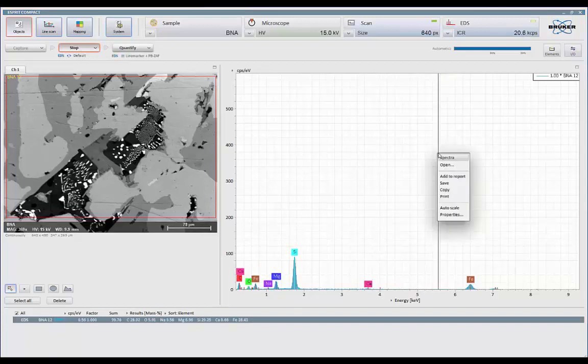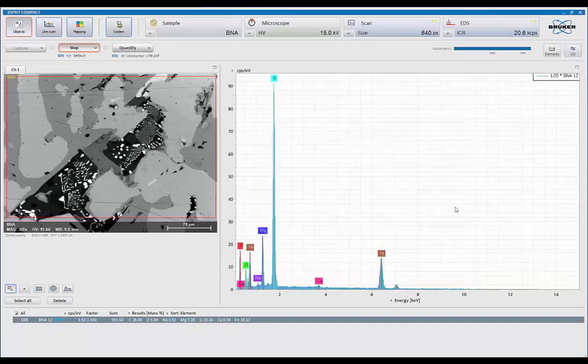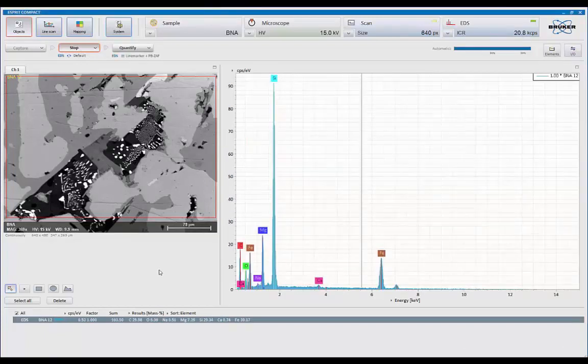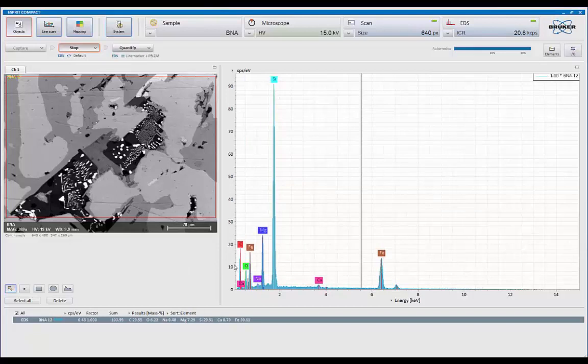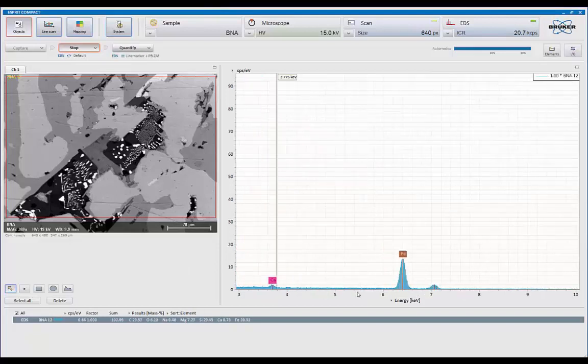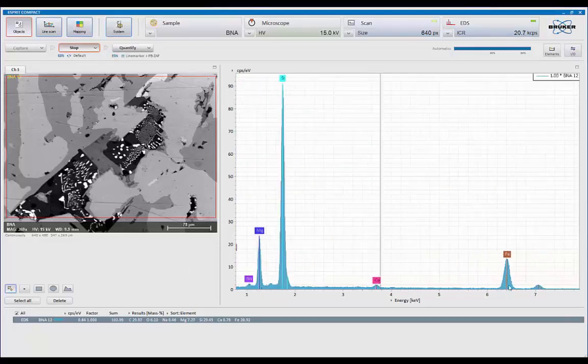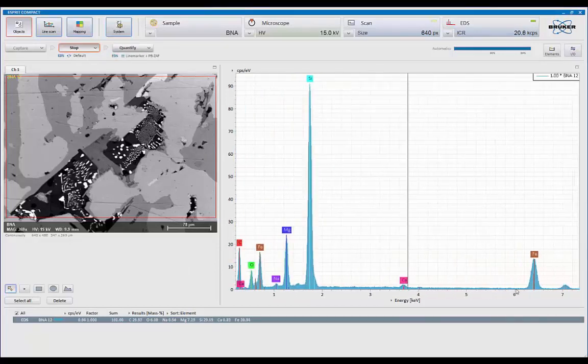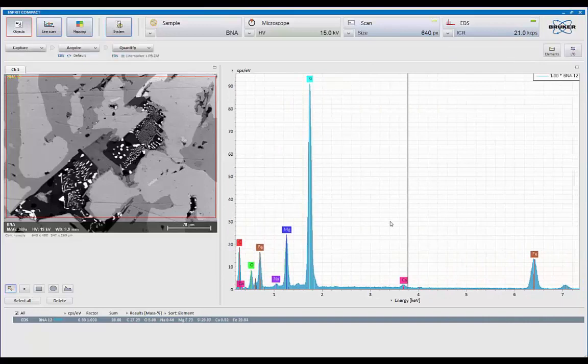So right now, I'm about 20,000 counts a second. Let's collect a spectrum at this location. Let's press the right mouse button. I can turn on the auto scale. And let's adjust the display using the roller ball. I can pick up the spectrum and slew it around. That looks pretty good.